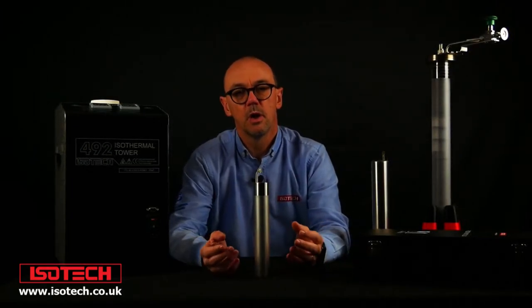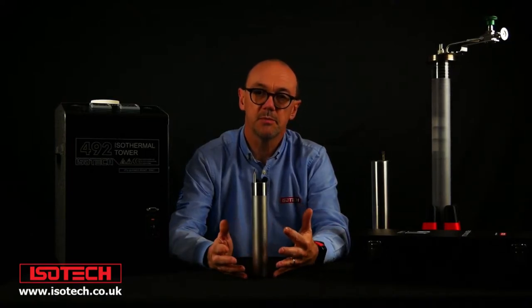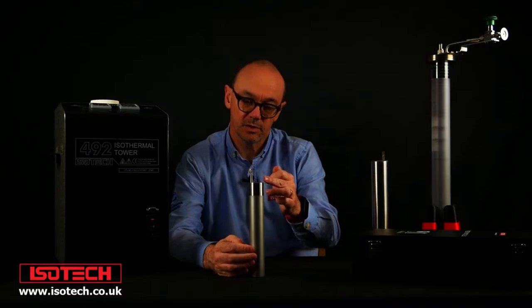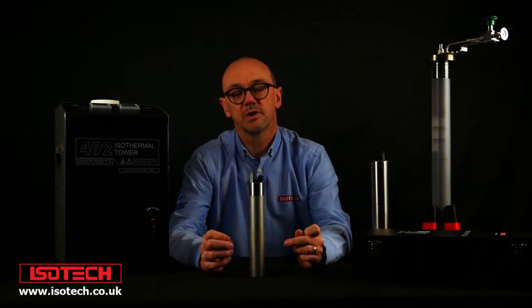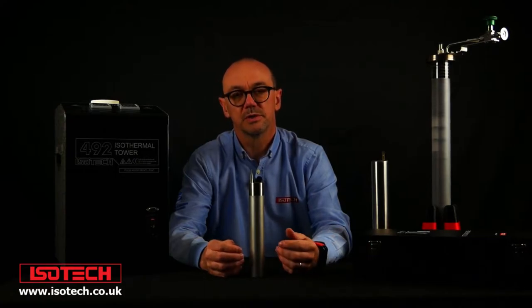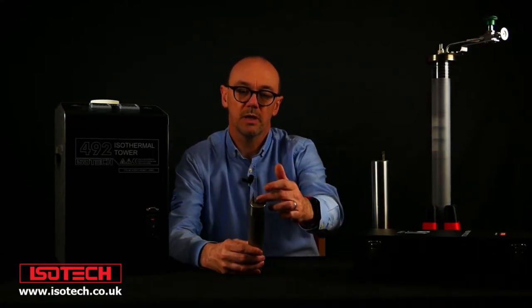So what is an ITS-90 fixed point cell? I'm going to go through different types. This particular one — we call it a slim cell from Isotech — is one of our smaller cells and is a good example. It has a graphite crucible inside a metal enclosure, and inside the graphite is the pure metal. This one contains pure tin — six nines pure, so 99.9999% pure or better. And there's a thermometer well in the centre.